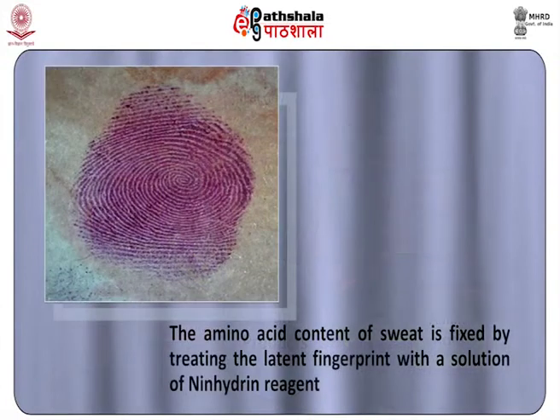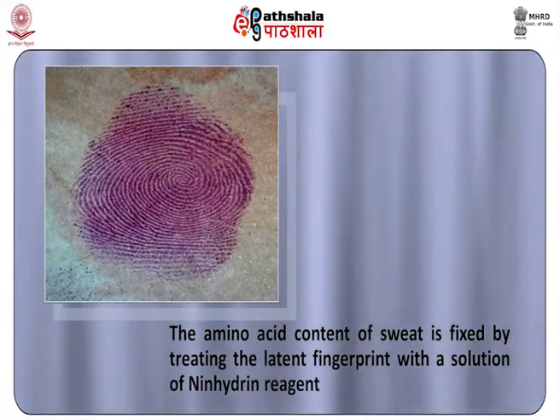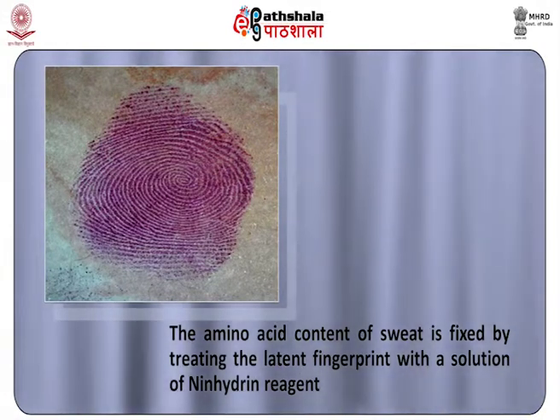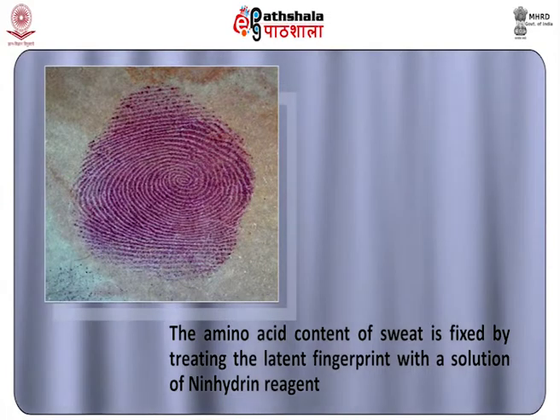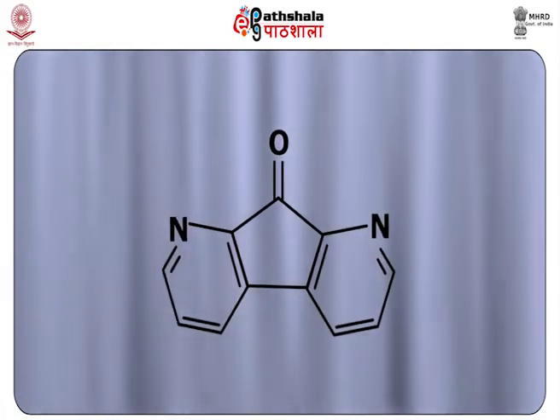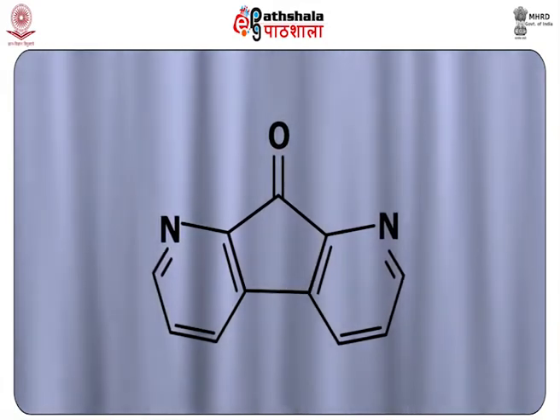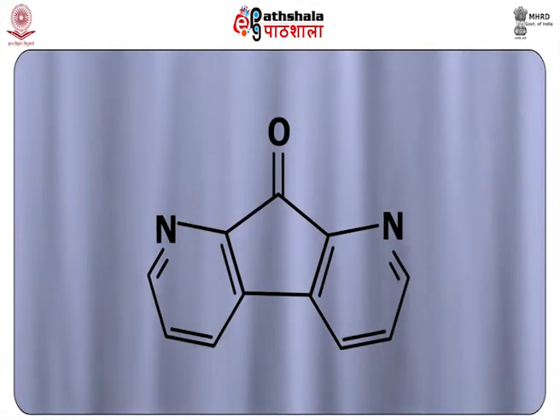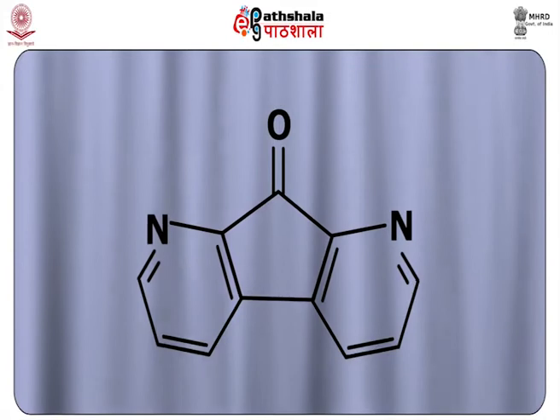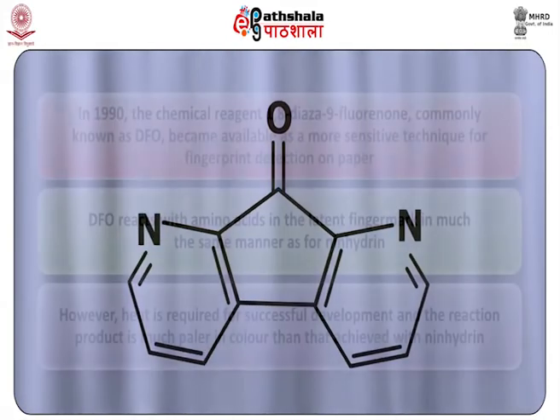acids. The amino acid content of sweat residue may be fixed by treating the fingerprint with a host of chemicals. The most commonly used is ninhydrin. However, where the latter fails to give prints of optimum quality, other derivatives such as 1,8-diaza-9-fluorenone, or DFO, may be called into action.